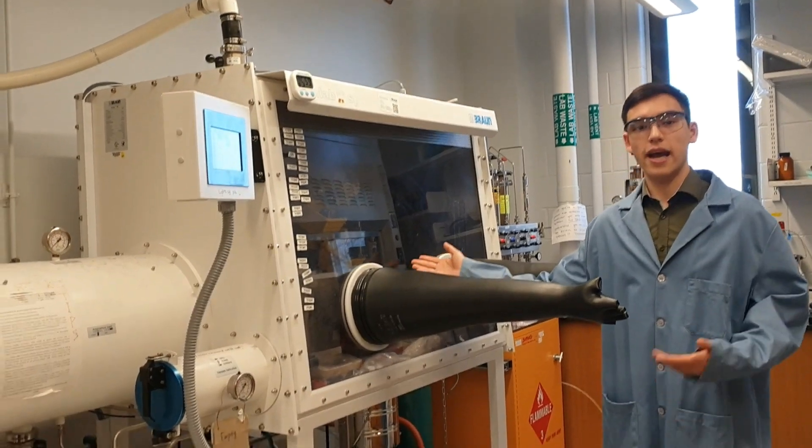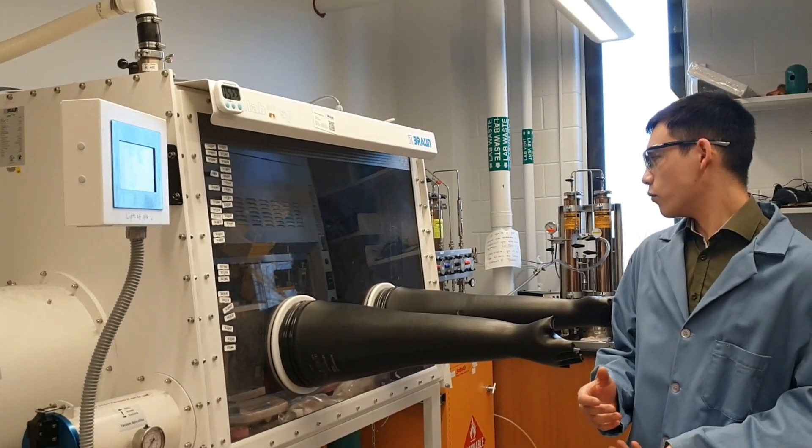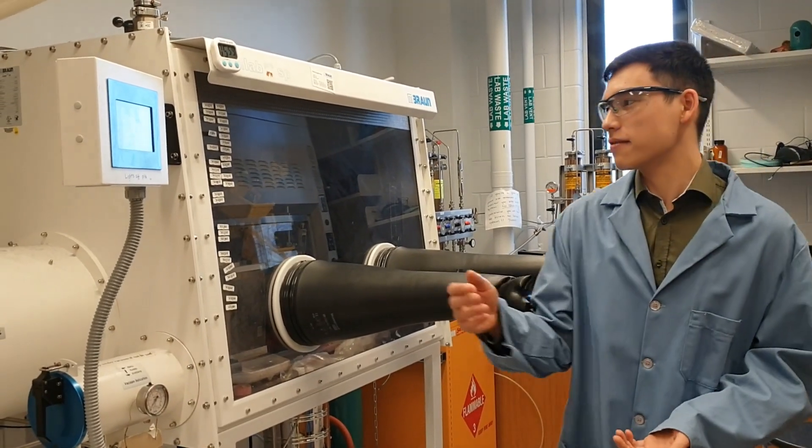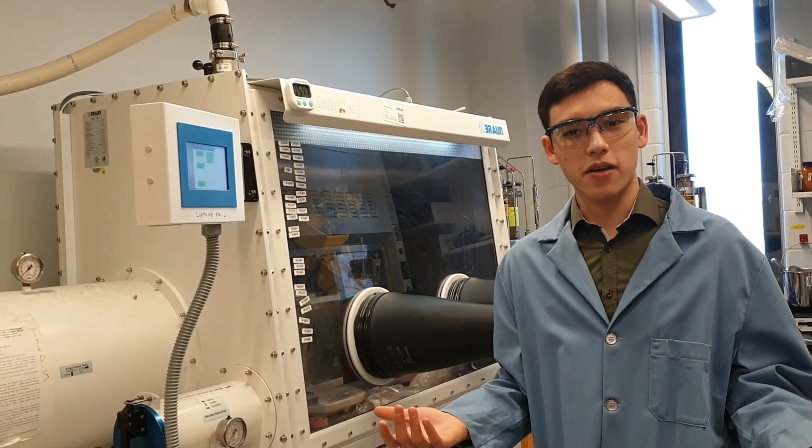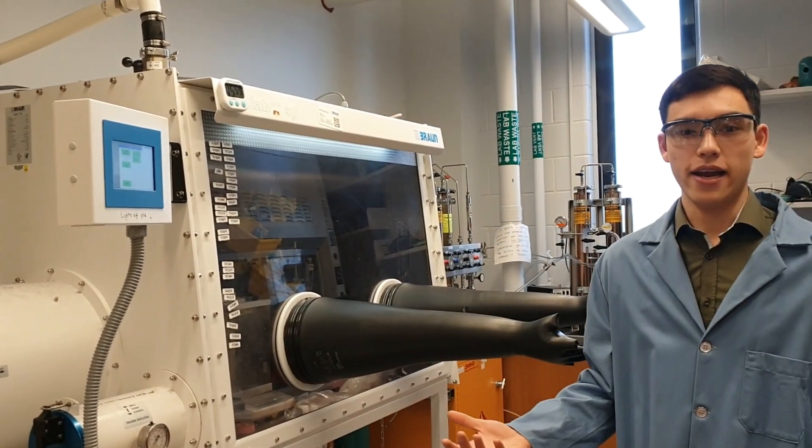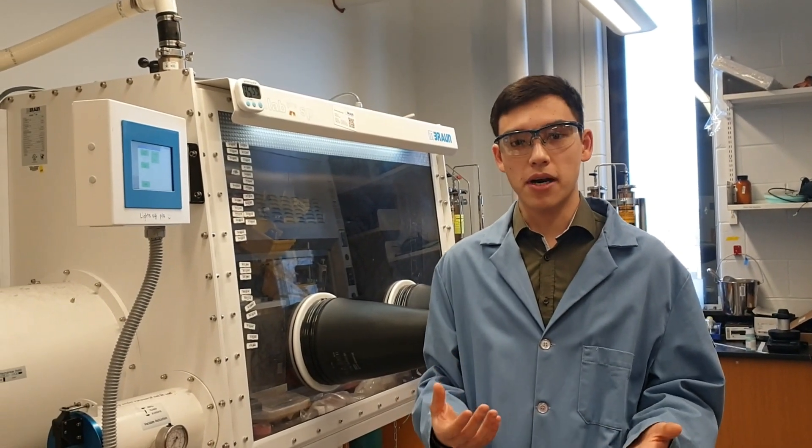Here you see our glove box. It's a nitrogen glove box, equipped with the typical amenities of the glove box. I'll turn the light on for you, so that you get a better view into the glove box, how it is set up, and how basically every lab member uses it to do some parts of their chemistry.